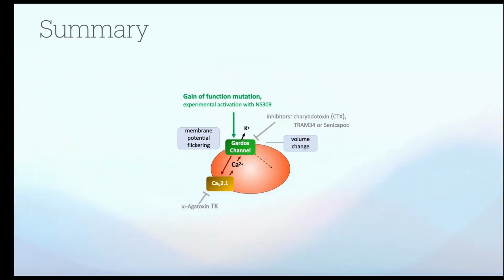The volume change may, or there might be other reasons that activate the Piezo channel. And the Piezo channel, as we heard from Nicoletta, is a non-selective cation channel. Probably most of you also know the channel otherwise. Also here we have a number of different manipulators, so Yoda1 for activation and GsMTx4 for inhibition are just examples.